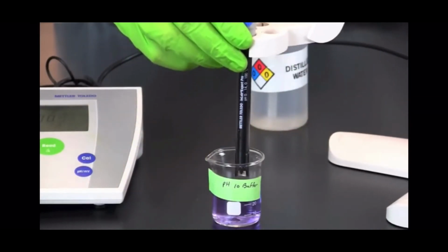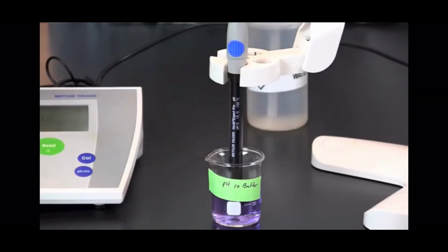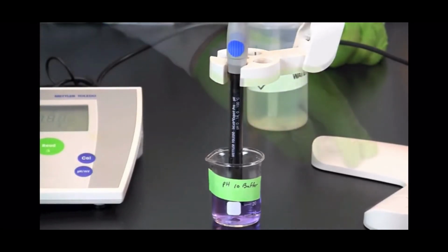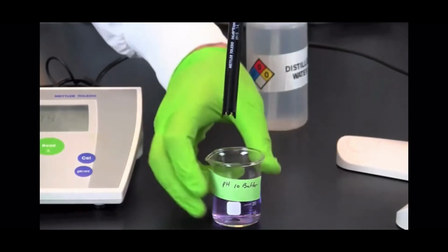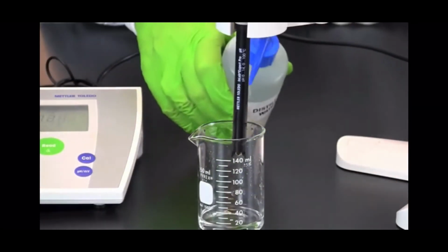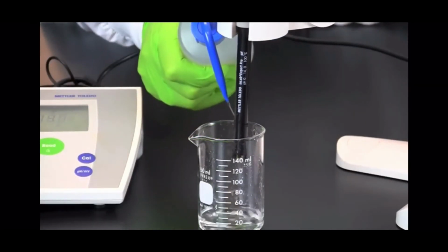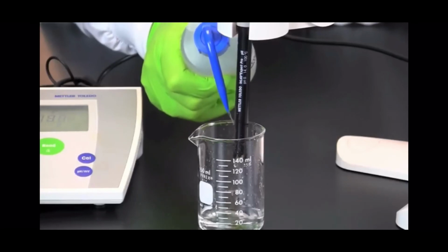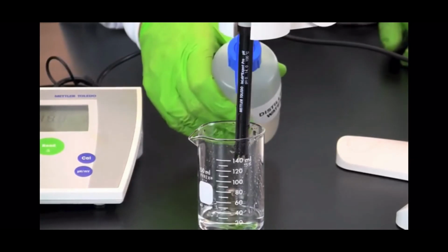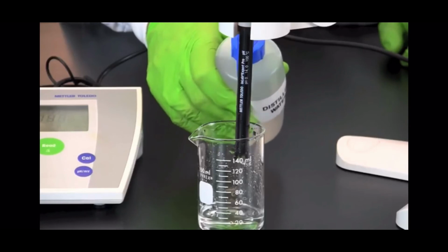You will then calibrate the final standard with a pH of 10. When the pH 10 standard has been calibrated, rinse off the electrode with distilled water. pH meters must be calibrated each time to ensure the accuracy of measurements. Using the 3 different pH standards for calibration provides for a wide range of accuracy. You are now ready to measure the pH of an unknown solution.